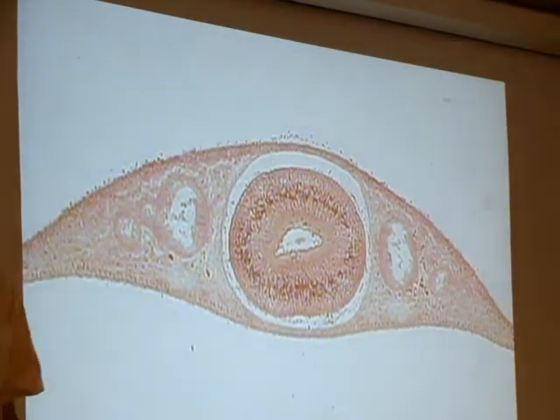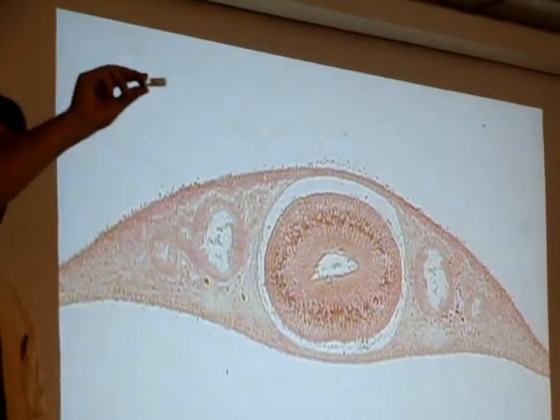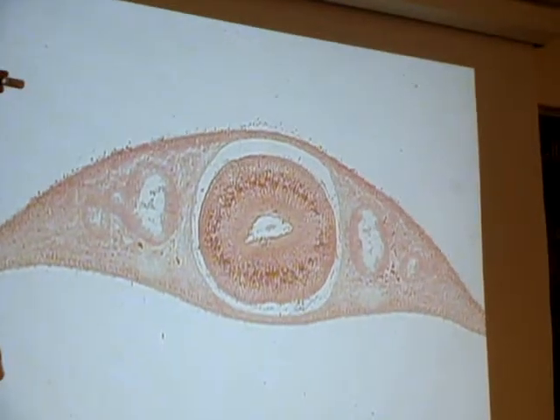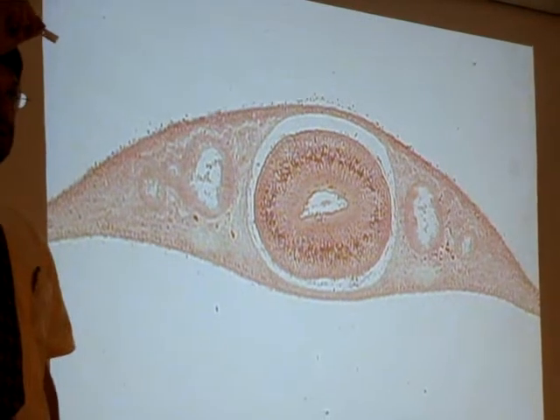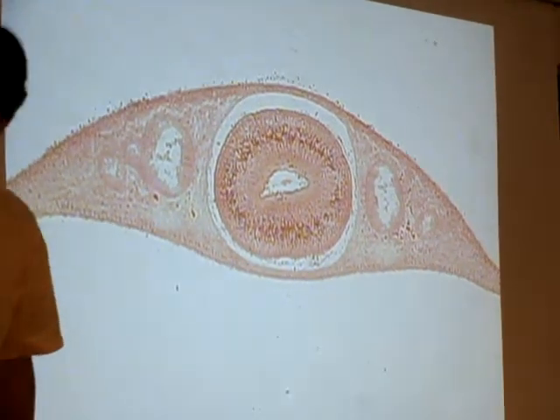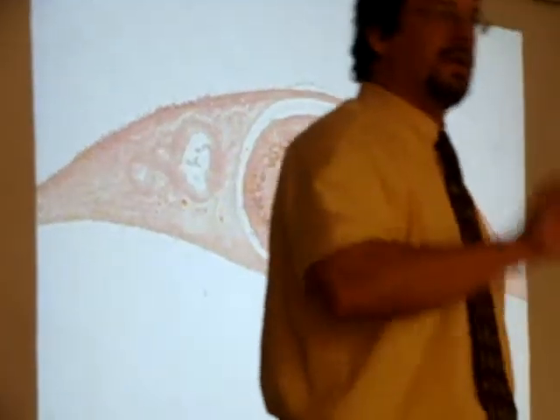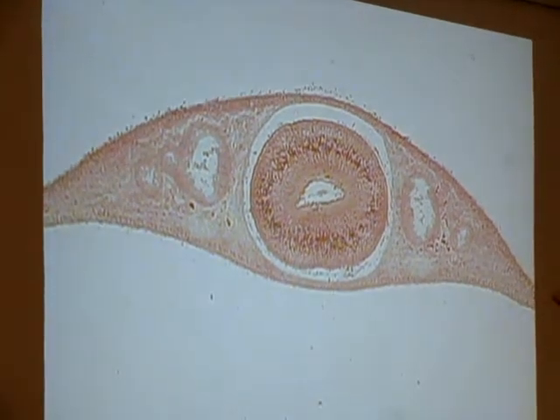Now you're looking at it as dead stuff in jars. How can you tell? Brown rice. A little brown rice. Little white threads are hydrozoa. Little brown rice are turbellaria. If you sit there and look at them long enough, you can see their heads. You can see their little eye spots. They're big enough to see. If you just take a quick glance, little white threads, hydrozoa, little brown rice, turbellaria. Is that as big as they get? That's as big as they get.